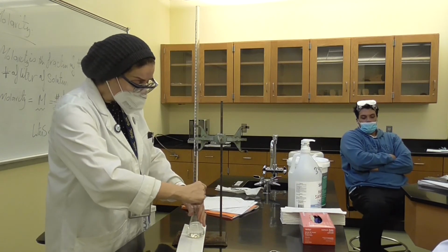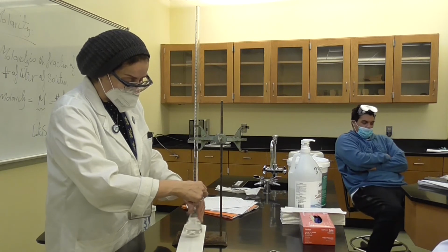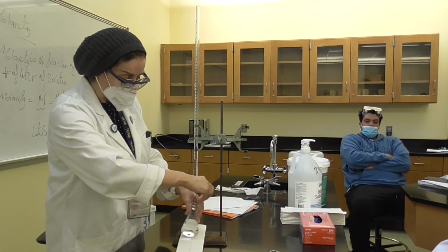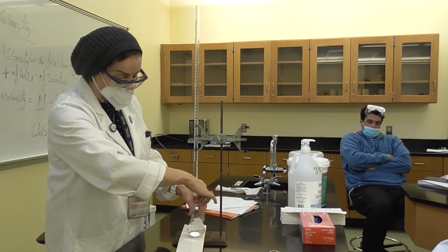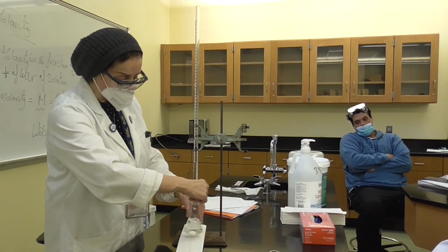That means we are reaching the end point. Try to go slower, drop by drop, holding the knob, because you don't want to miss the end point. One drop will make the whole difference. When it stays, that means you reached the end point.